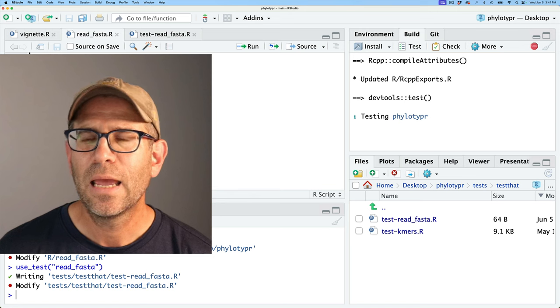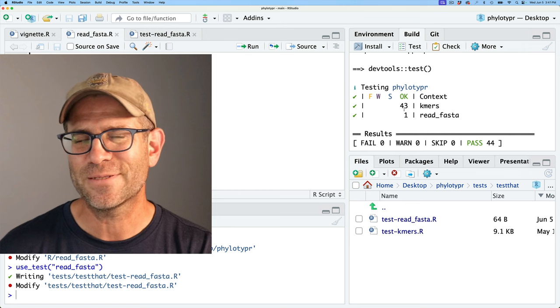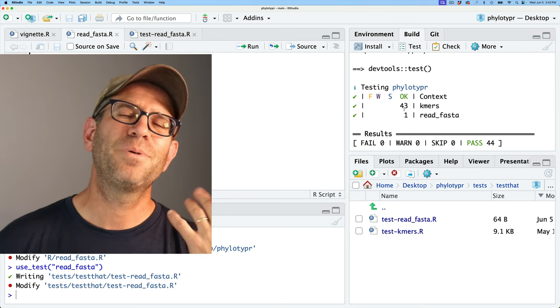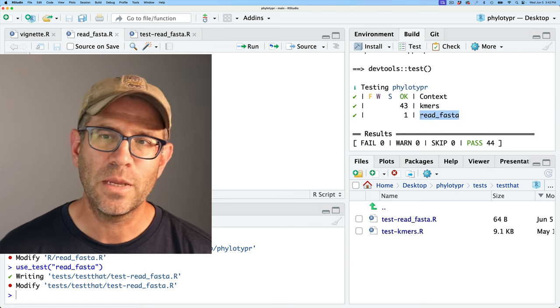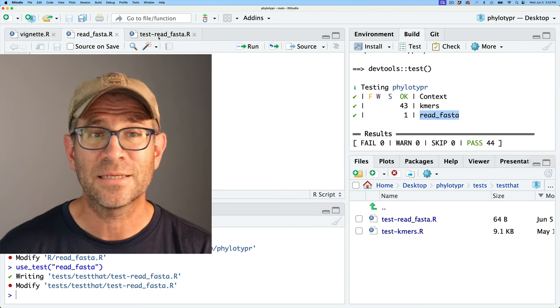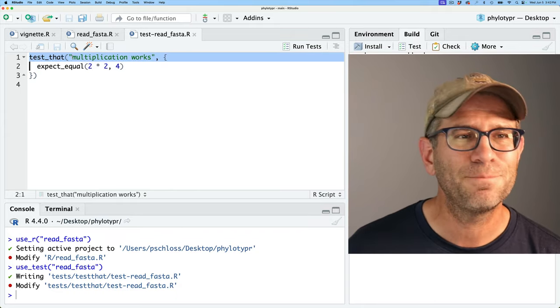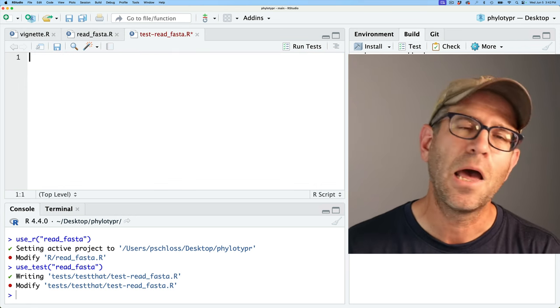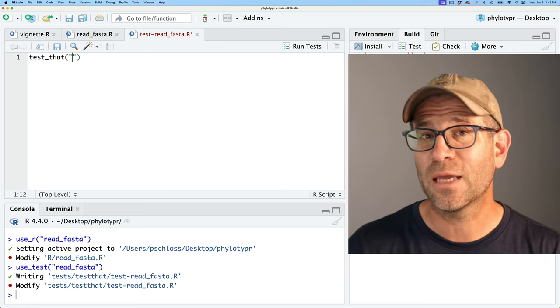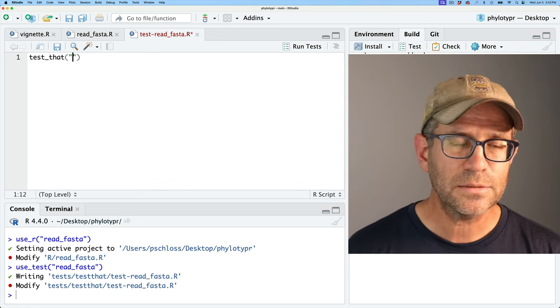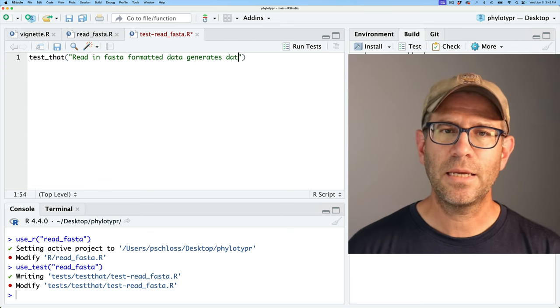I'll save the vignette and run the tests. That takes a little time because there's still some C++ code in there, but we now have a second context — read_fasta — and the placeholder test passing. I'll go ahead and delete the placeholder and replace it with a proper test. I'll say test_that with the name 'read in FASTA formatted data generates a data frame'.